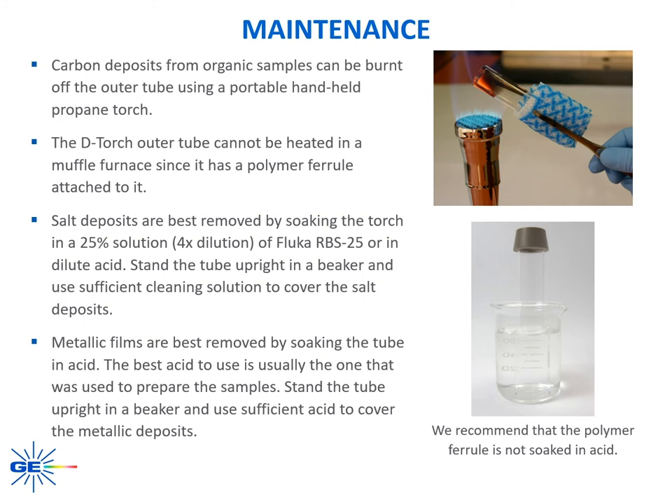Now we will briefly review maintenance of the D-Torch quartz and ceramic outer tubes. It is important to always use safety gloves when handling the outer tube. Carbon deposits from organic samples can be burnt off the outer tube using a portable handheld propane torch. Note that the D-Torch outer tube cannot be heated in a muffle furnace since it has a polymer ferrule attached to it. Salt deposits are best removed by soaking the outer tube in a 25% Fluca solution or in dilute acid — stand the outer tube upright in a beaker and use sufficient cleaning solution to cover the salt deposits. Metallic films are best removed by soaking the outer tube in acid; the best acid is usually the one used to prepare or digest the samples. Stand the outer tube upright in a beaker using sufficient acid to cover the metal deposits. Note that we recommend the polymer ferrule is not soaked in acid.